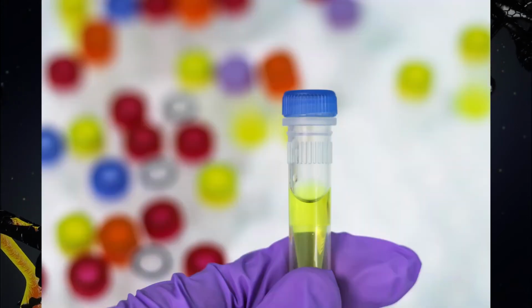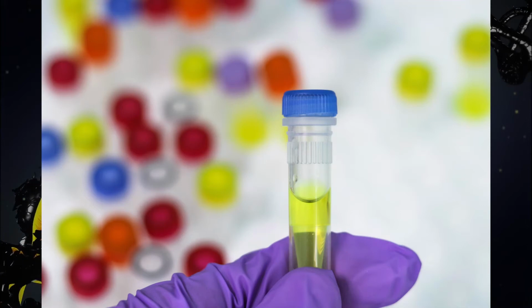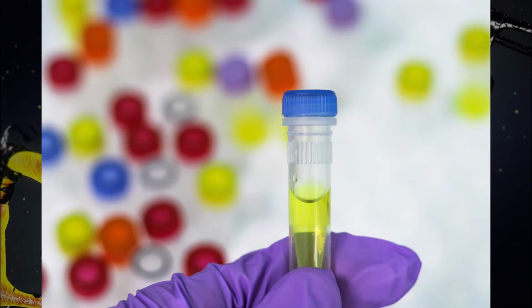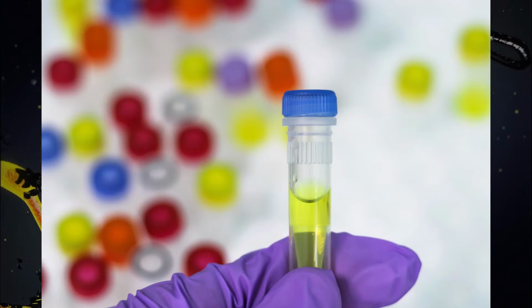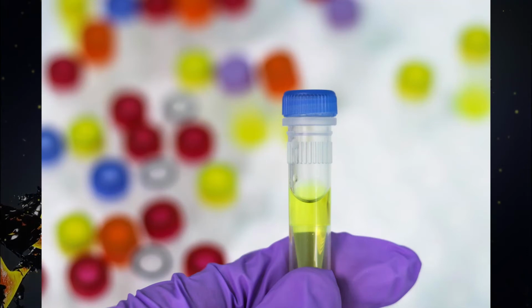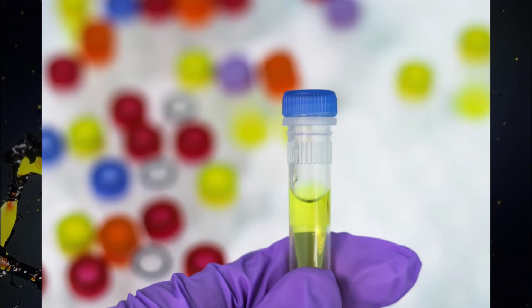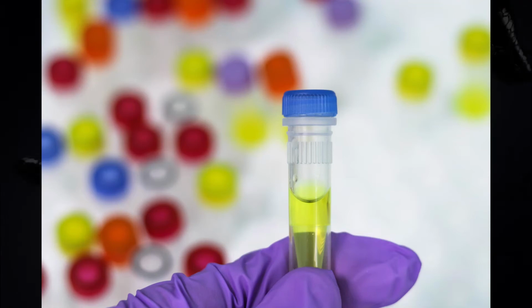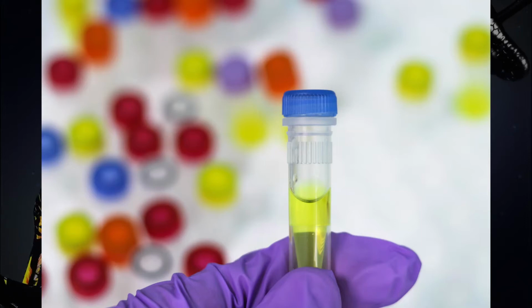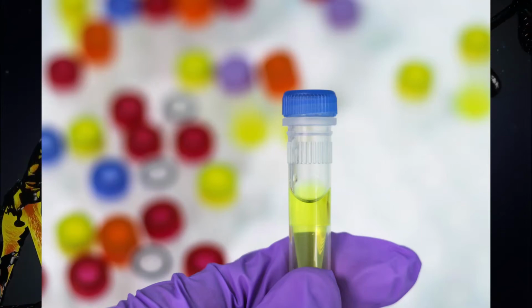In order to get this to happen, you need something called a primer. A primer is a short section of DNA that matches with your DNA or RNA. This is what allows it to be amplified. By matching the two, you get it to become confused and think the DNA needs to be replicated again and again. By choosing primers that specifically match to a DNA sequence, you can be very selective, but they need to be both a forward primer for one side of the DNA strand and a reverse primer for the other.